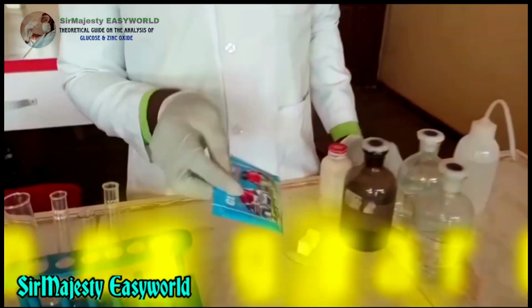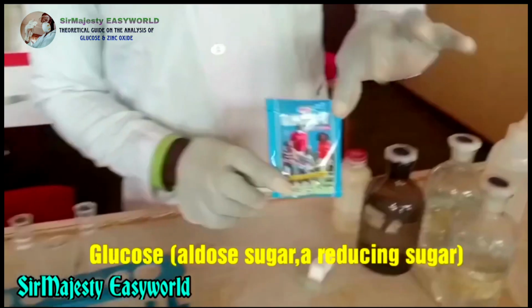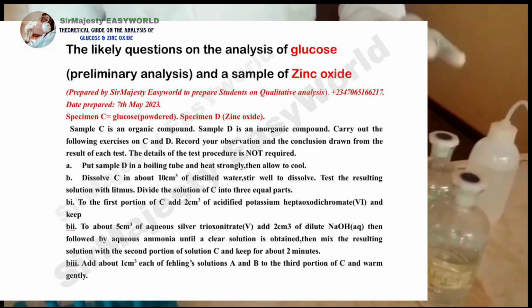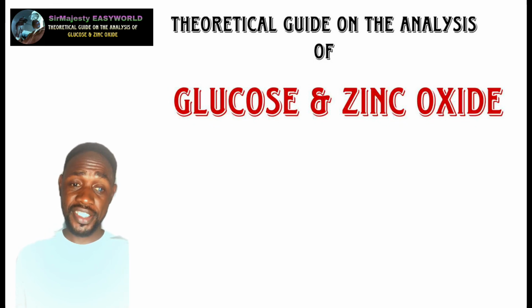Then here we have the test sample. Here is our glucose, D-glucose, which contains the aldehyde group. Today, I'll be giving you the theoretical guide on the analysis of glucose and then zinc oxide.